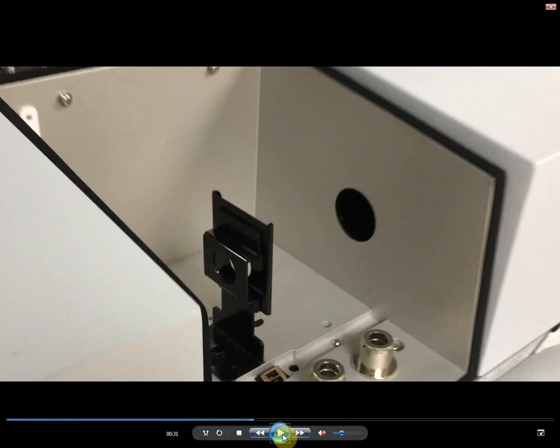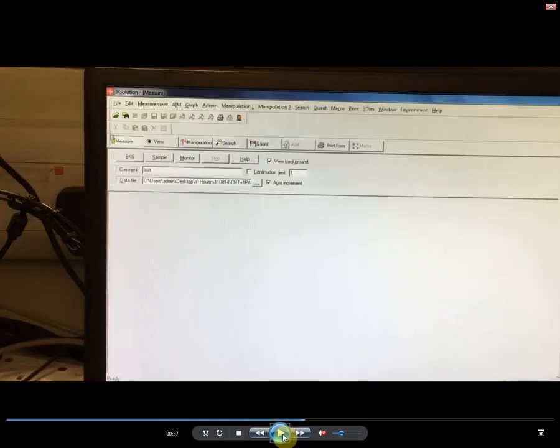Before starting the analysis, check to ensure that there is no sample in the instrument left behind from previous experiments. To perform the analysis, first, you will need to perform a background scan. The purpose of doing the background scan is to remove any background signal which may otherwise affect the analysis of the test sample signal. To perform a background scan, press the BKG button. Click OK.